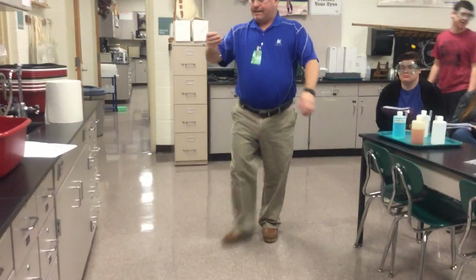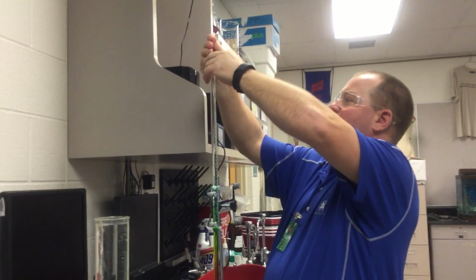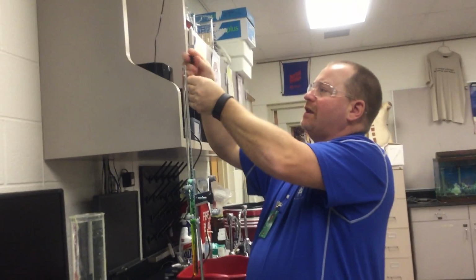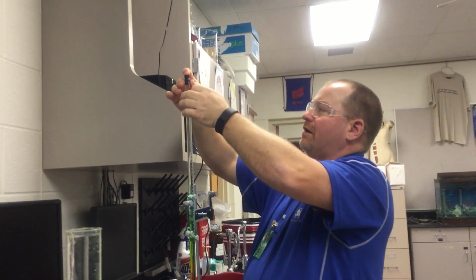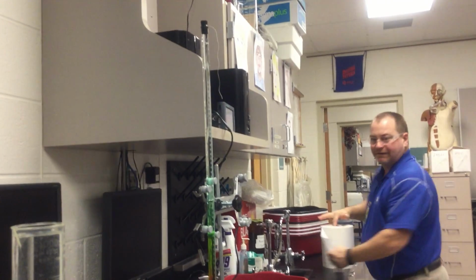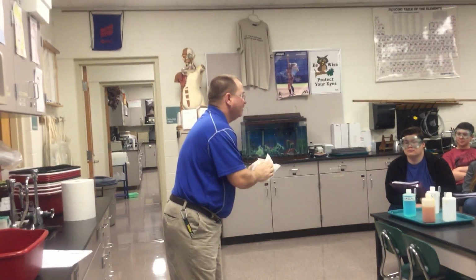Okay. I'm going to take this and I'm going to put it in here. The toughest part of this is getting it to sink, because the magnesium doesn't want to sink. There, I've got it to sink. Okay, I need to get it about 5 centimeters. Now, a little bit of water is going to come out here, but that's not going to hurt anything. And how do I know that that's water coming out of here and not acid? Because if it were acid, what color would it be? The orangish yellow down at the bottom.